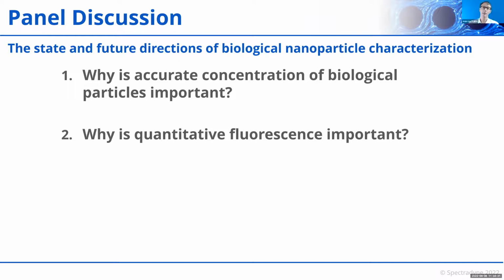Yeah, cool. We didn't explicitly show gating in the data that I've showed today, but it's implicit in the analysis because, for example, that subset of fluorescent GFP EVs amid a sea of background non-fluorescent ones, we're essentially isolating those to measure, based on their fluorescence, their concentration and size distribution. So it's definitely possible, and that's an exciting idea for what could be done with this. That's great.